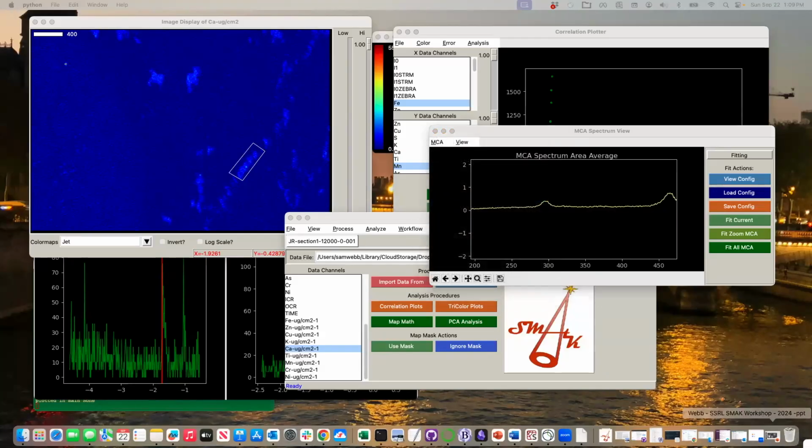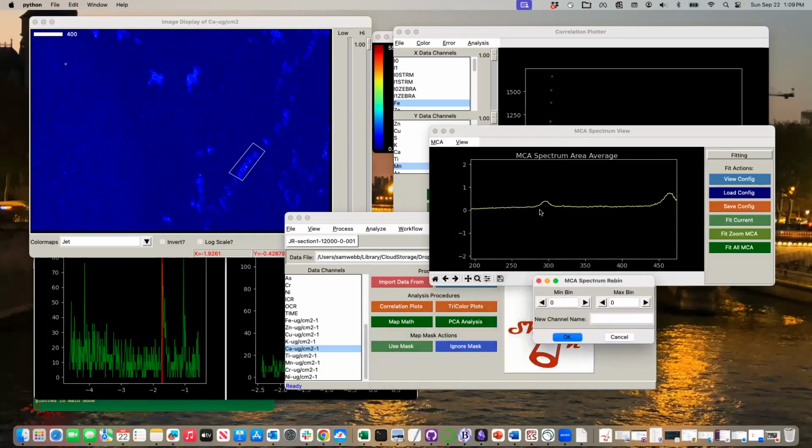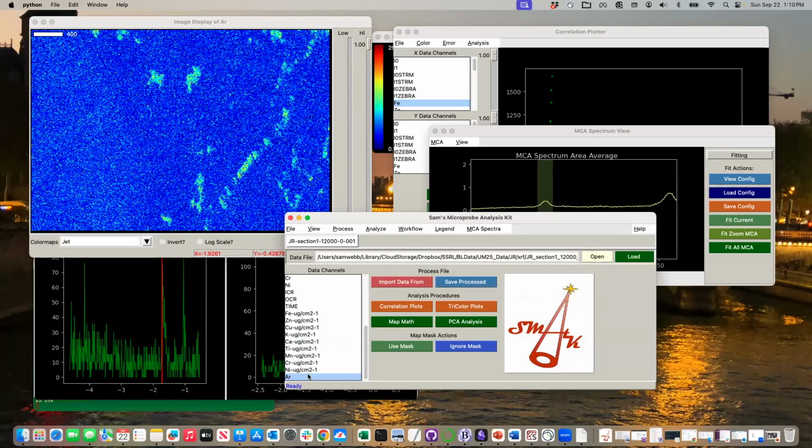And I would pull that window up from here and choose, say, bin 270 to 310. And maybe I make that a little bit lower here, a little higher here, lower here. There we go. I can't wait to see what my argon looks like. Hit OK, it finishes. And you're like, great. Oh, argon's everywhere except for scatter. So it's not very exciting, as it turns out.